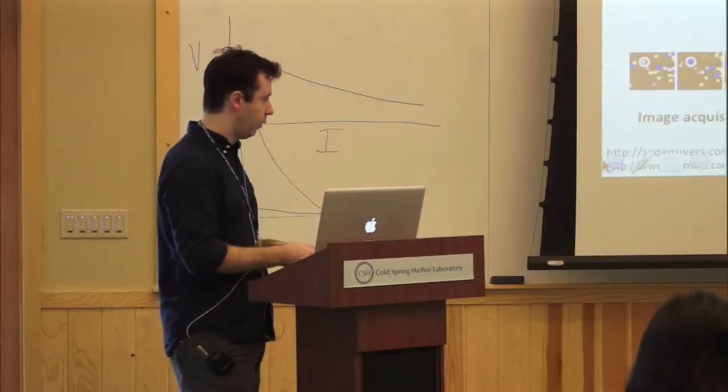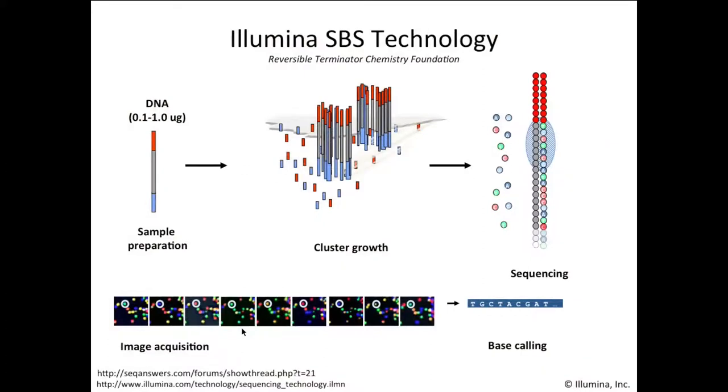And yeah, so basically, if you follow the same spot, you end up with a sequence of the DNA fragments. What happens to the dots that overlap? Yes, this is a very good question. The technology is essentially tuned so as to minimize the number of dots that overlap. But you're absolutely right, and you can see some of these guys here. Sometimes you have dots that are very close to each other.